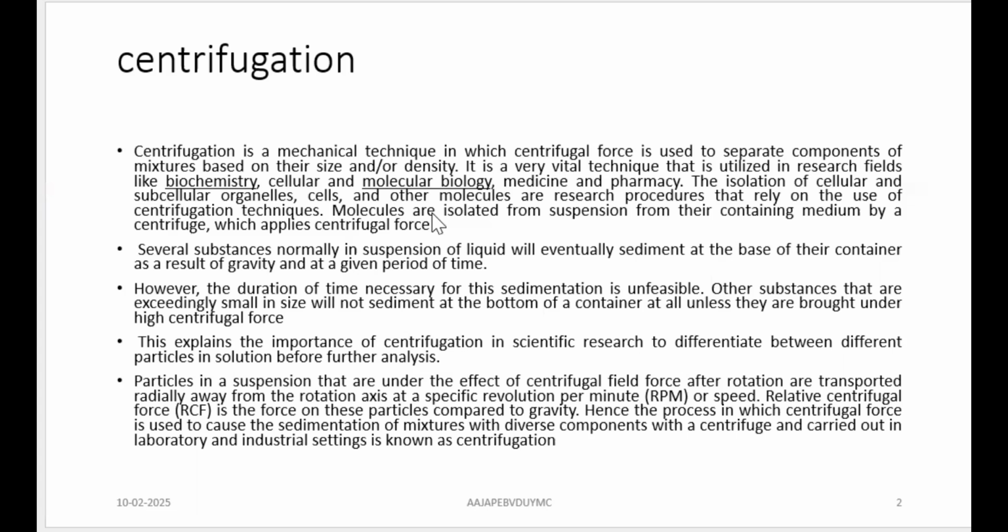At the same time you have analytical centrifuges, which are going to not only separate the molecule but also analyze its characteristics, which we have to learn. Now, when you talk about separation, you talk about centrifugal force, the size and density of the particle, and another important factor is the duration or time for which centrifugation is run, which will allow the sedimentation of a particle. Right? So these are the few key points when you talk about a centrifugation process.